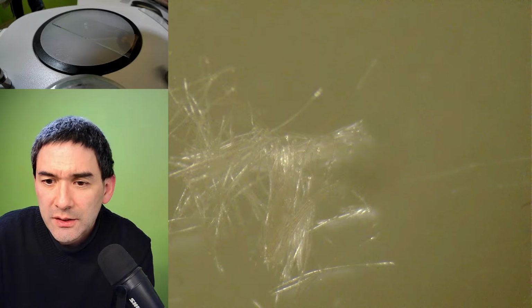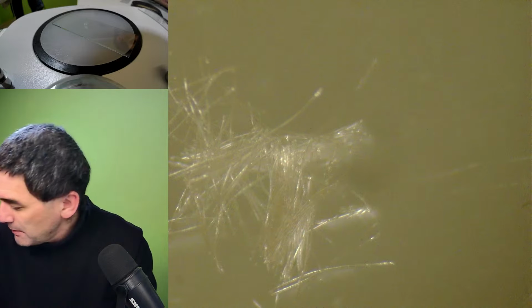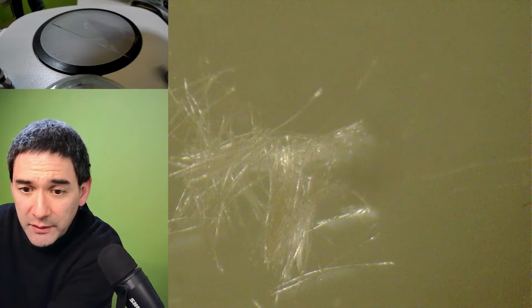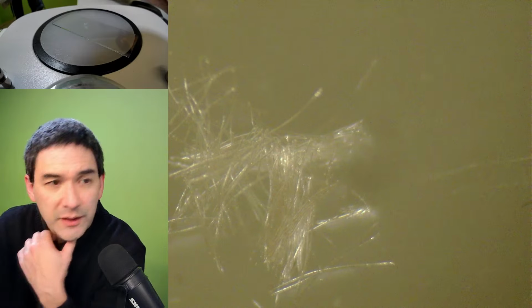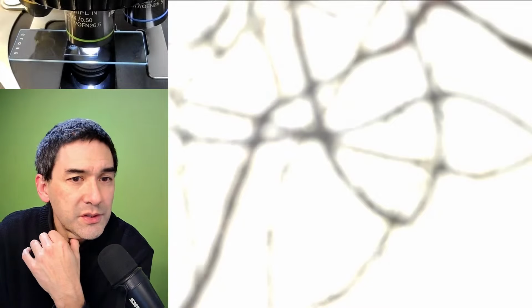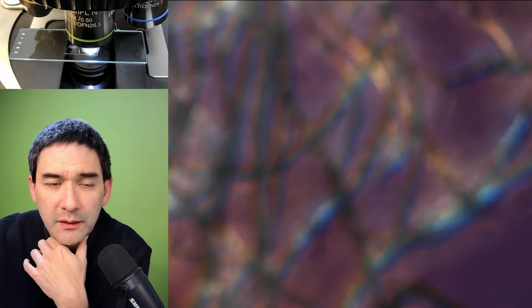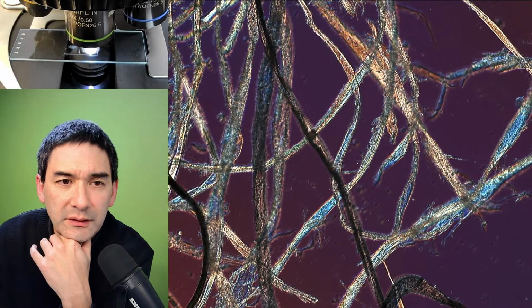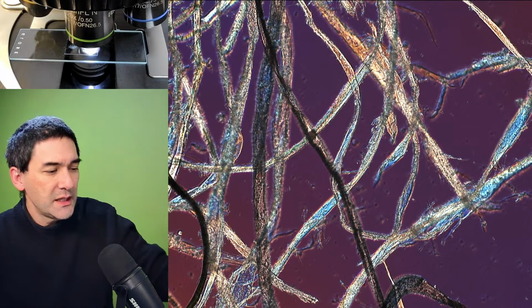So what I'm going to do now is maybe put in a nicer sample so that we have something to look at while I go through a couple of the questions, because there are some off-topic questions as well that I want to talk about. See, this is way too bright. Okay, here we go. So let's have a look here.